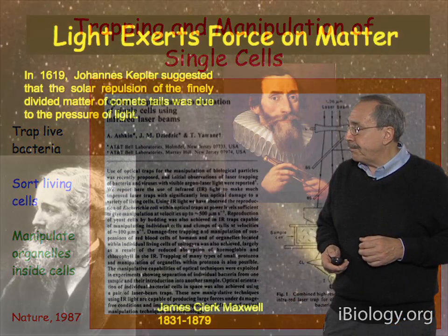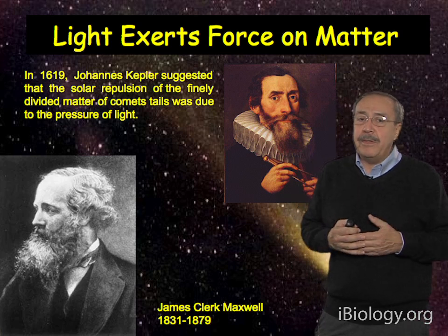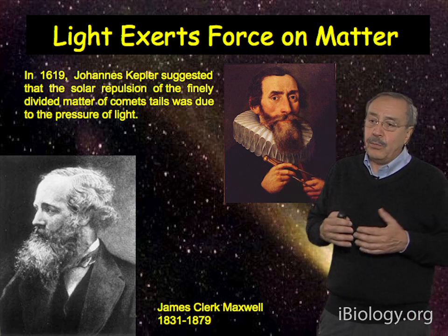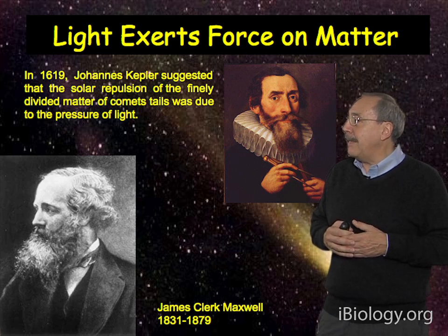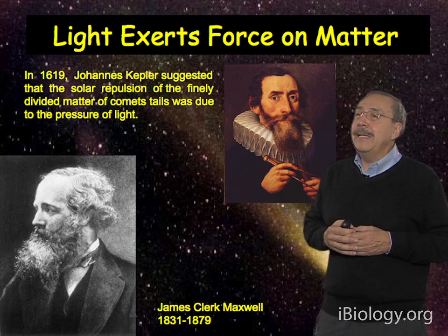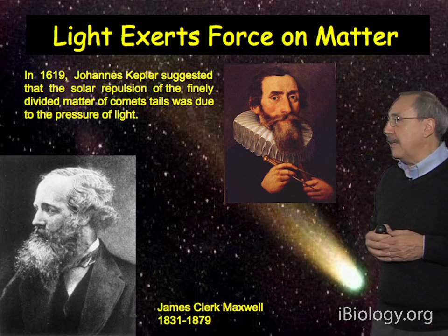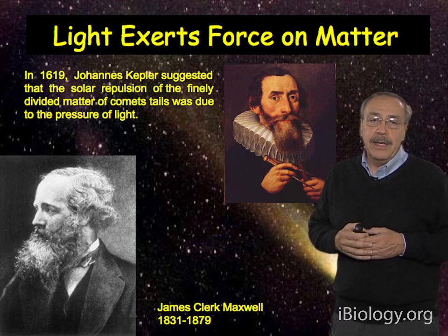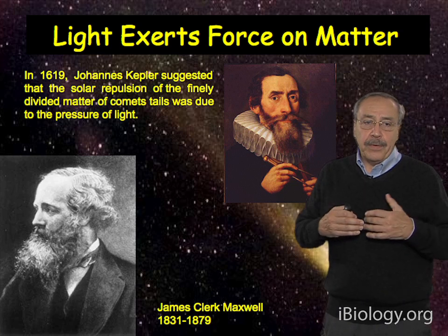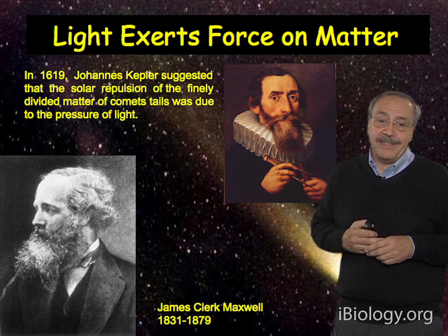Now, the fundamental physical principle behind the idea of the laser tweezers or optical tweezers is the fact that light exerts force on matter. In fact, in 1619 already, Johannes Kepler suggested that the solar repulsion of the finely divided matter that comes off the tails of a comet is due to the pressure of light exerted by the light coming from the sun.